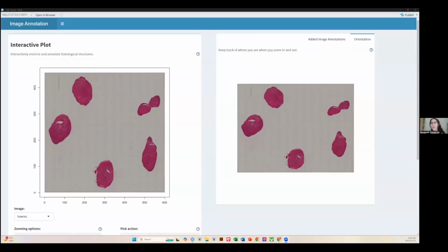Before you do that, they weren't able to see the Shiny app. Could you repeat everything from that step? Yeah. So a Shiny app is just a term, from my understanding, of an application that is very hands-on. So a lot of people can create Shiny apps for different gene analysis modalities. For instance, I really like a Shiny app called ShinyGO, which I can share with you guys.